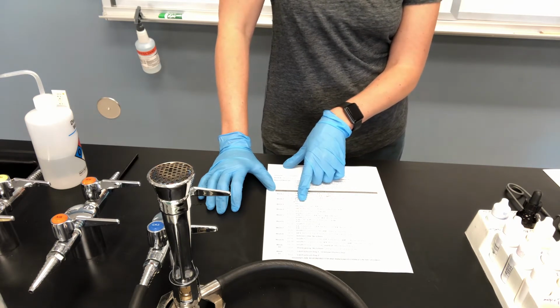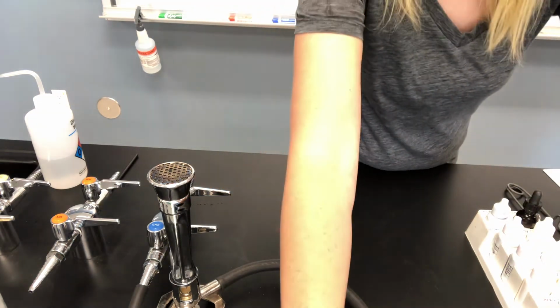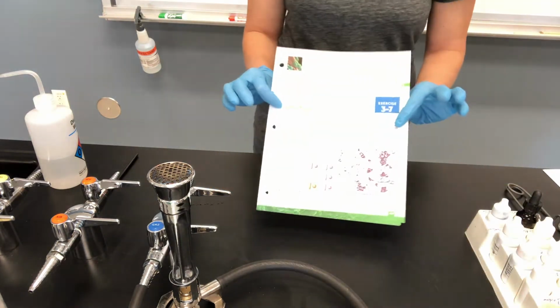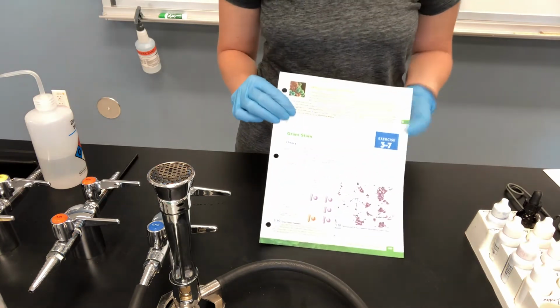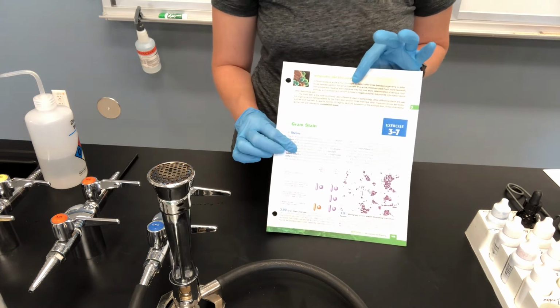We are now on to the Tuesday of week 3 lab activities with our gram stain. This is lab 3-7. This is the first of our differential stains. When we take a look at our gram stain packet 3-7, it has some introductory information about the background of the development of the stain, and we're learning that in chapter 4 as well.